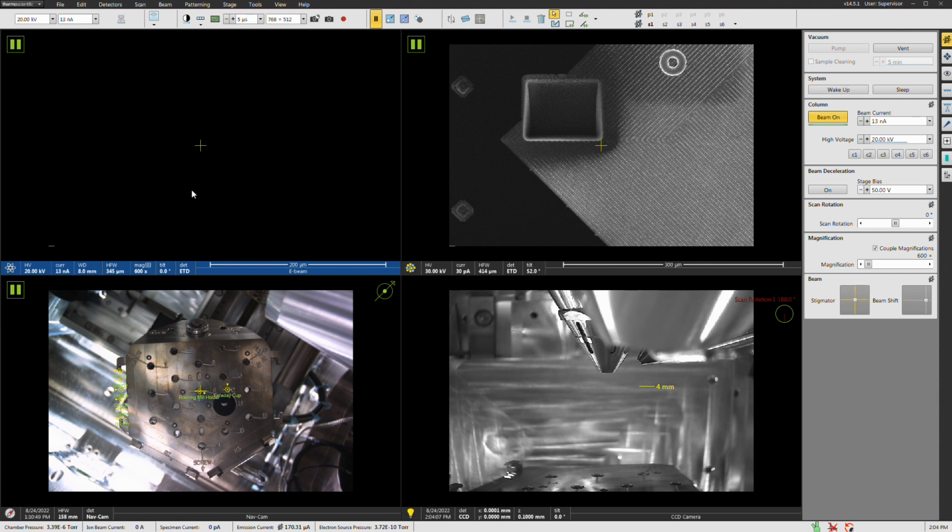Now this is a really good camera, so we do have that helping us here, and this is a good sample. It's one of the reasons why we use this as a standard test sample. And nickel's good in general because it's fairly high Z, it scatters pretty strongly, so we can get nice patterns from it. So anyways, that's kind of an existential question, right? What voltage to use?